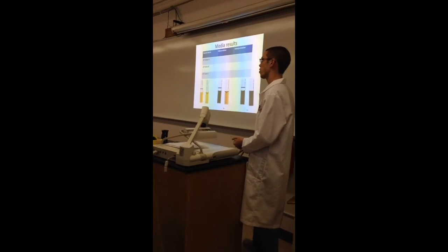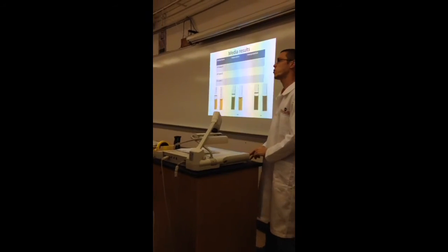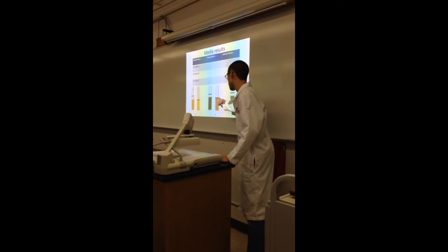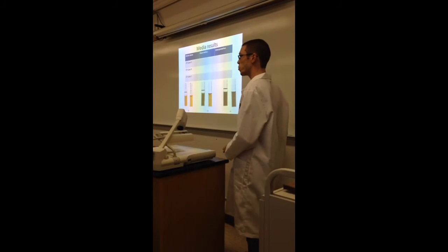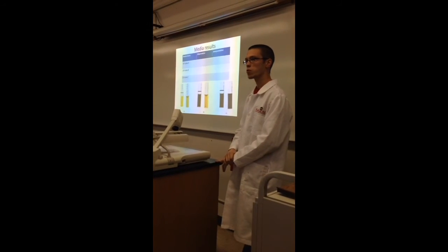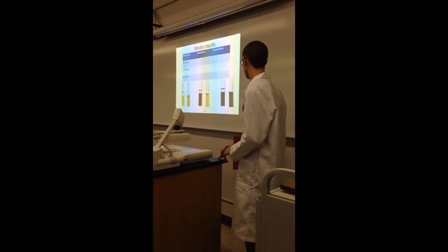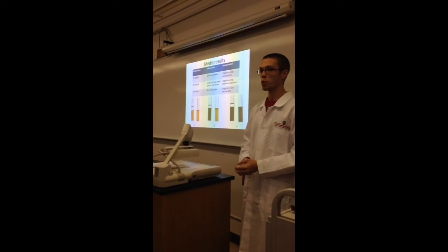But especially for a lot of people's unknowns, only the top of the tube would turn yellow, and that's fine too. Since it is aerobic respiration, you would expect that at least the top is going to turn yellow because that's where they have access to the most oxygen. But if the whole tube turns, that's perfectly fine too. And what about for number C? What does two green tubes represent? Non-saccharolytic. Okay? What did you say the indicator was again? Bromthymol blue.